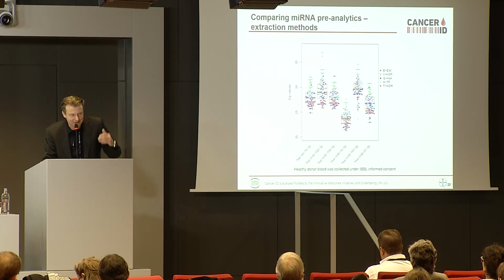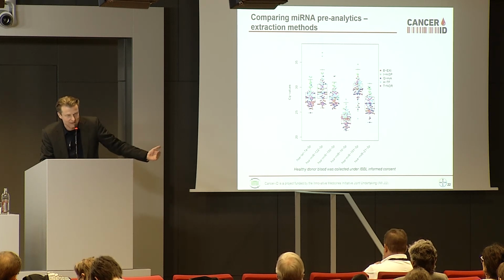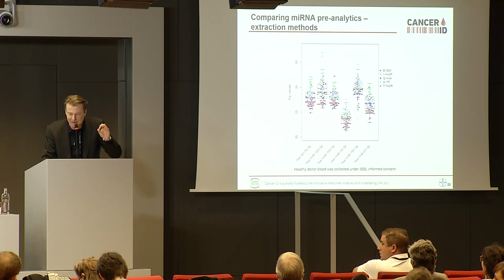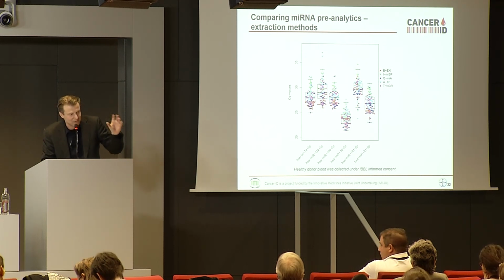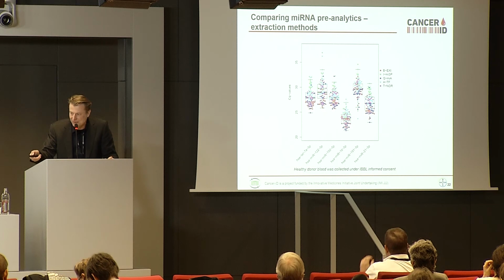But this is just giving us benchmarking data for each and every site that participates in these studies, so that they know where they are compared to the others. And usually what you would expect is for each and every technology or protocol, you find a cloud where each site clusters. If this is not the case, there's something wrong, right?